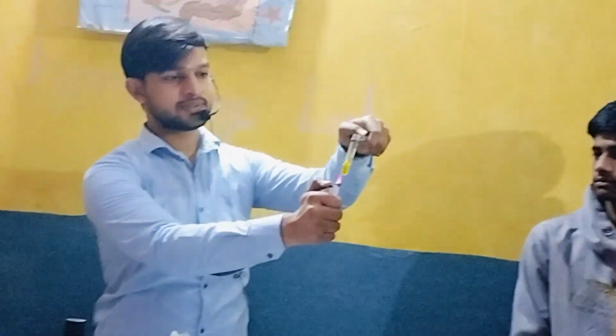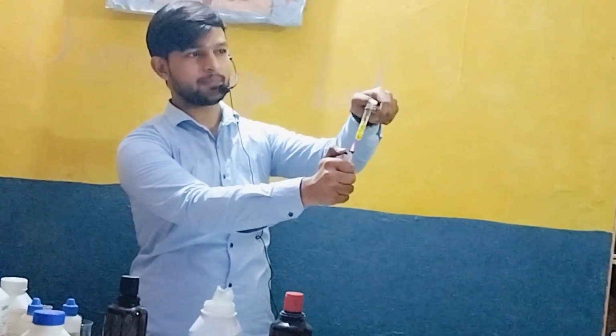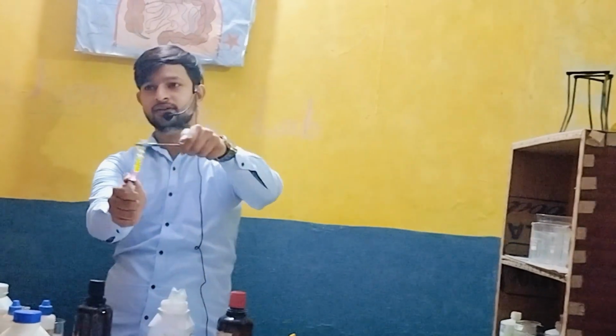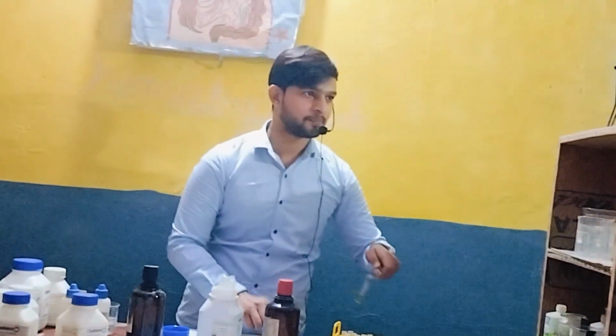Radhe and you please beside. You can smell is coming. It is a different smell. Yes. So this smell is sulfur dioxide smell. You can smell everywhere. Smell is coming now. So this is sulfur dioxide and sulfur trioxide, SO2 and SO3. It spread in the room.